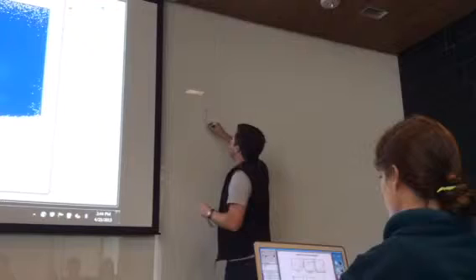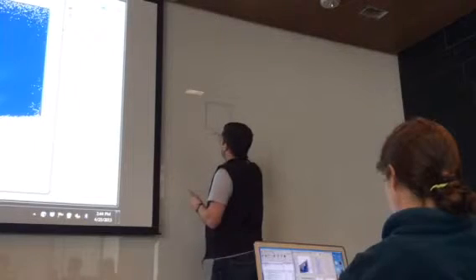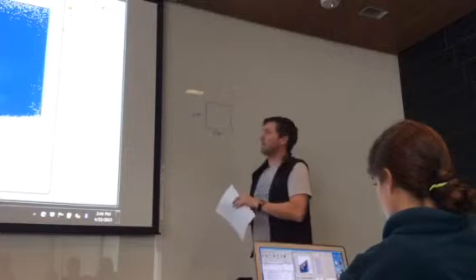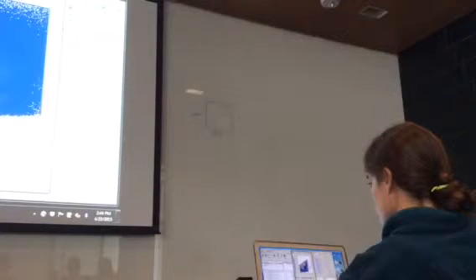Gate. Single cell? You gate according to the size parameters of forward scatter and side scatter. Like this. So the first step is to create a plot that looks like that, which is forward scatter and side scatter.